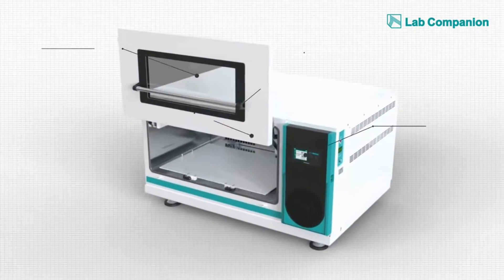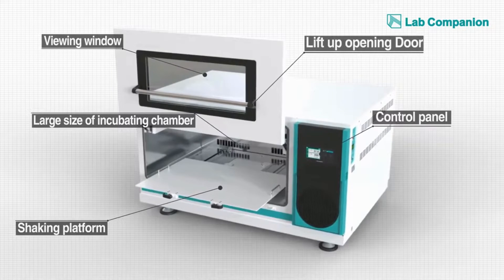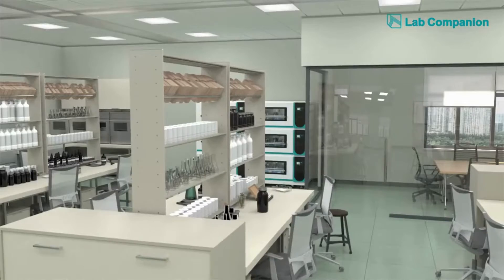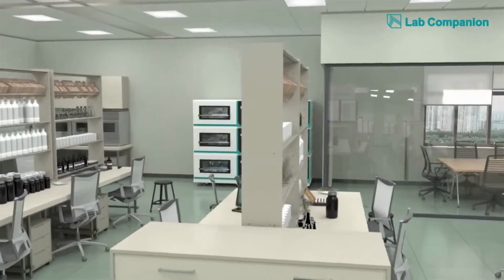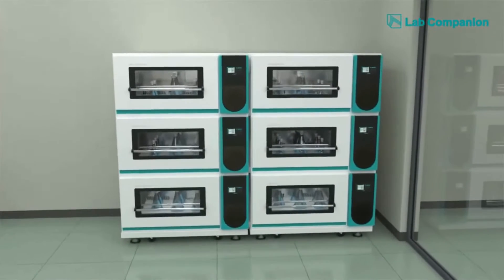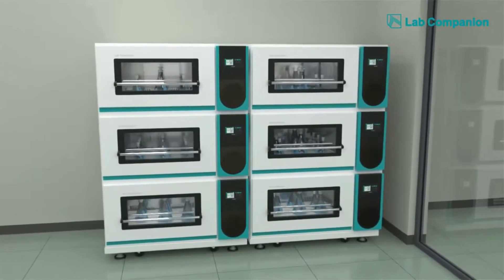Its main components include a large incubator, inspection window, door, shaking platform, and control panel — all of which are designed for the most stable structure so that a multitude of experiments with intensive shaking can be simultaneously conducted in a tight space.